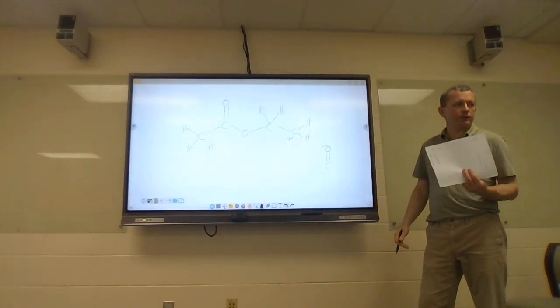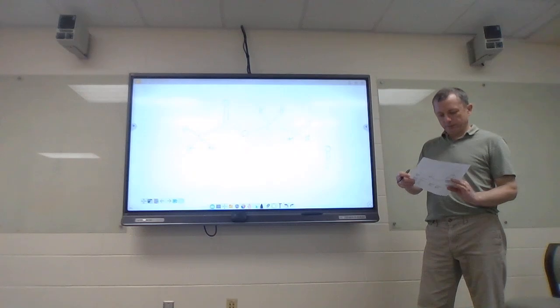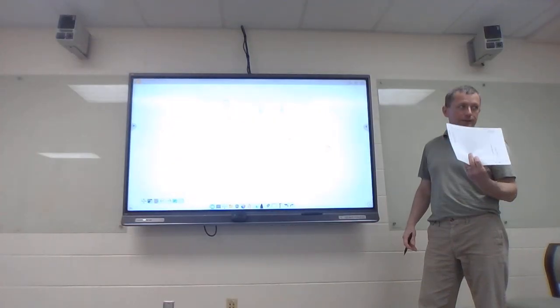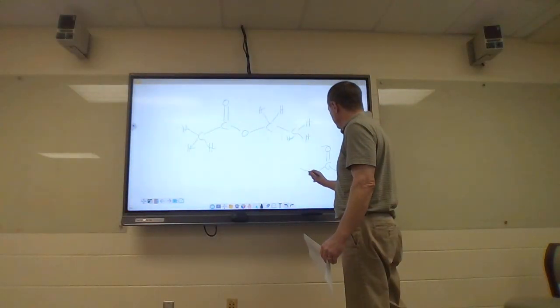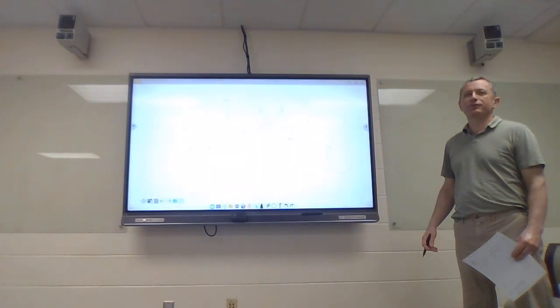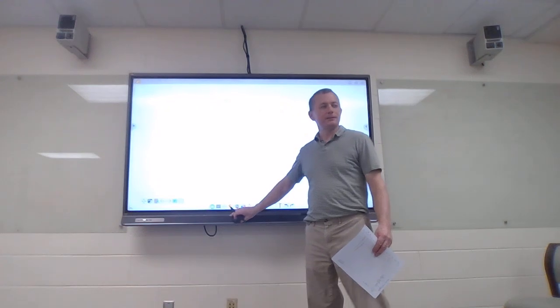I'm now trying to figure out where are my other 5 carbons. And who's looked at the integration yet? What's it add up to? 5. How many hydrogens do you have? So I must have symmetry. But you're missing a part. I can't go symmetric and be linear with 6 carbons. Oh, it's a ring. It's a ring!